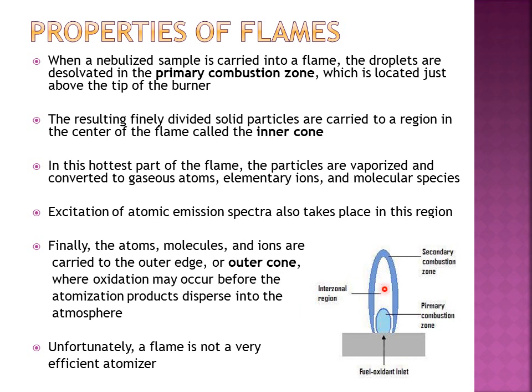So now the sample has entered this region, and this is the hottest part of the flame. And here the particles are vaporized and converted into gaseous atoms, elementary ions, and molecular species. So the atomization phenomenon is completed over here. And if we are discussing atomic emission spectroscopy, the emission phenomenon also occurs here.